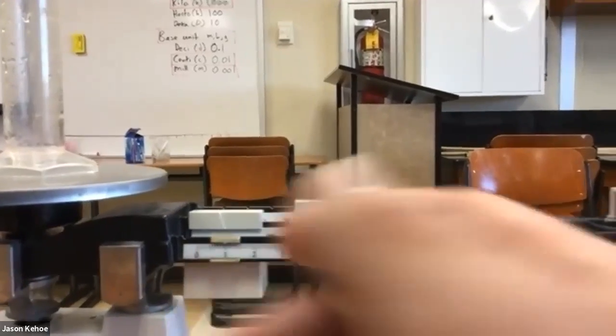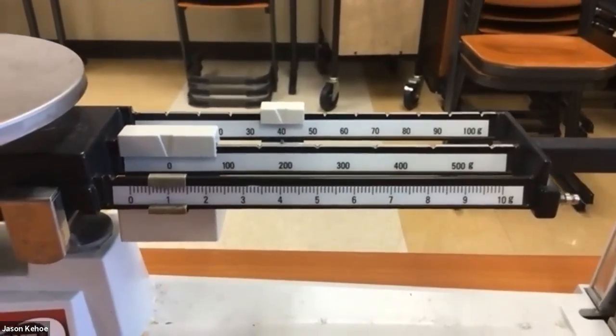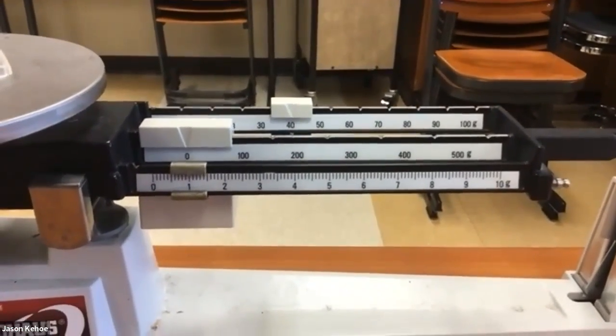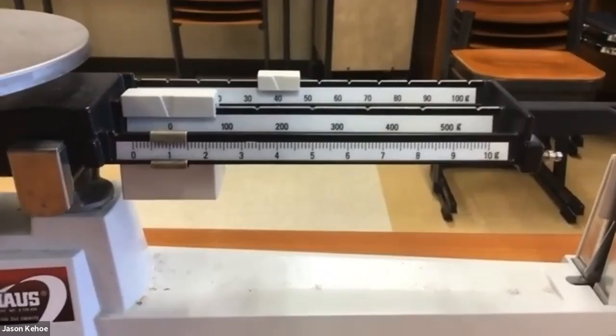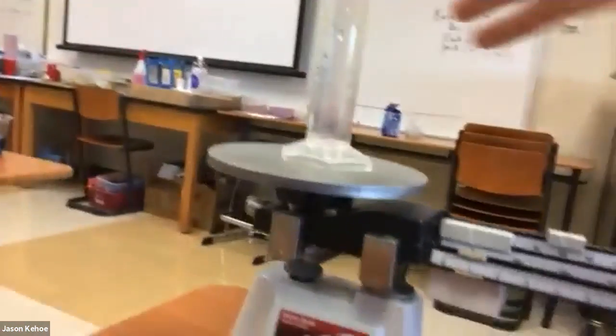Here is the large graduated cylinder. I'll leave it on there for a second. You can always pause the video if you need to. Remember, we're trying to measure to the nearest 1/10 of a gram. If it's right on a line for the ones place, you'll still include the decimal, but it'll just be 0.0. All right, that was the large graduated cylinder.